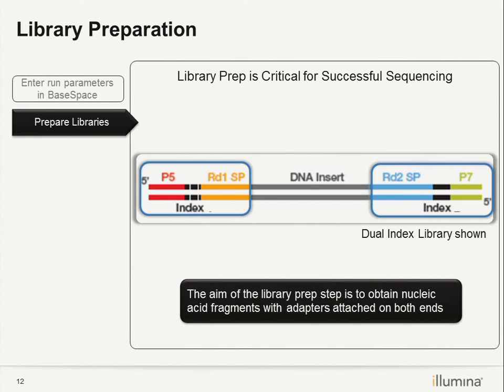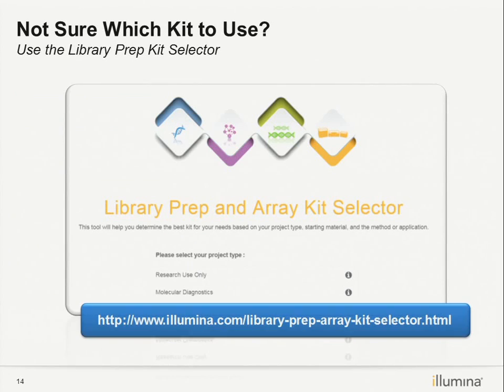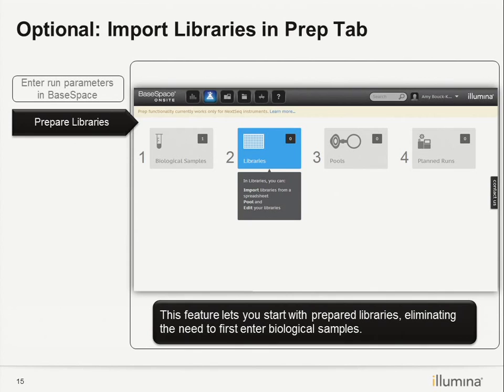Okay. So library preparation, we have just mentioned that, and Aaron is going to give you a little bit more detail on that, so I'm not going to go over details, but you can check this link. We have the library prep kit selector, which helps guide you through choosing the right kits to use.